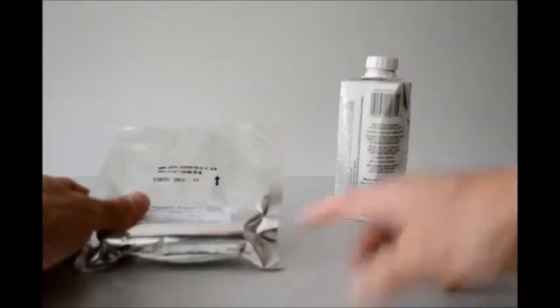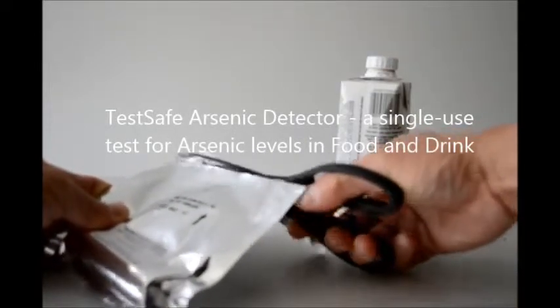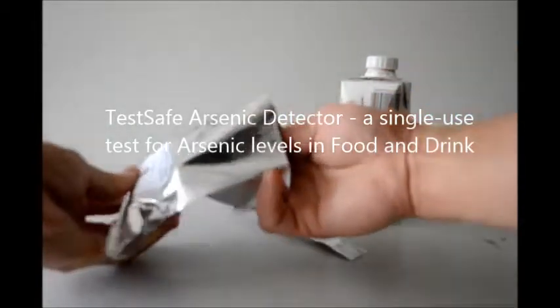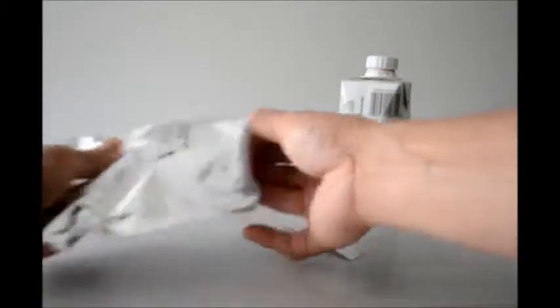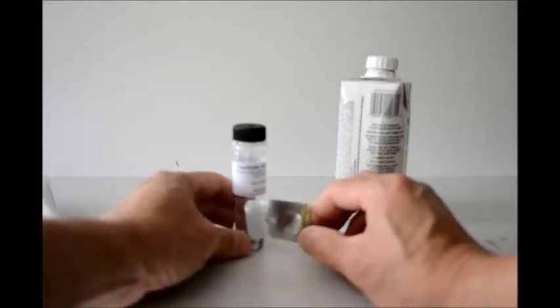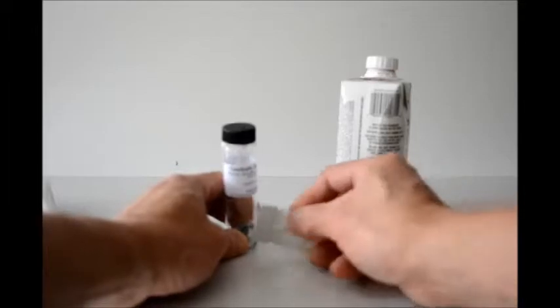We're going to use the TestSafe arsenic detector. Let me proceed by taking the contents out of its pack. It's a single-use product. There is a detector, a medicine dropper, and a packet of solution that comes with it.